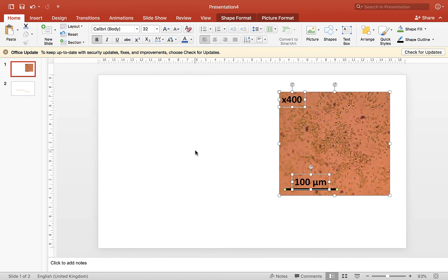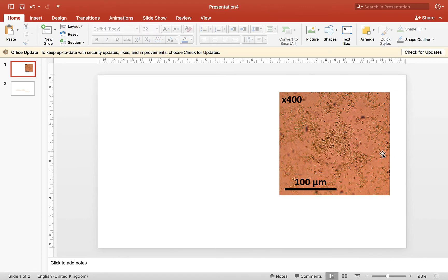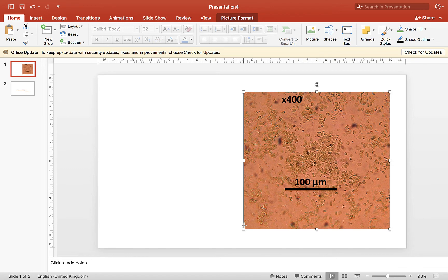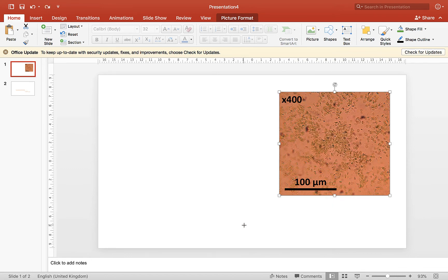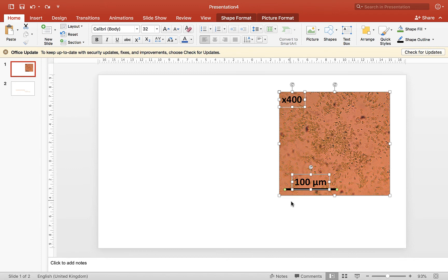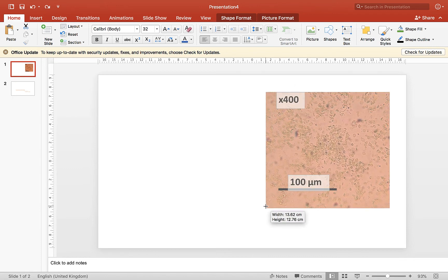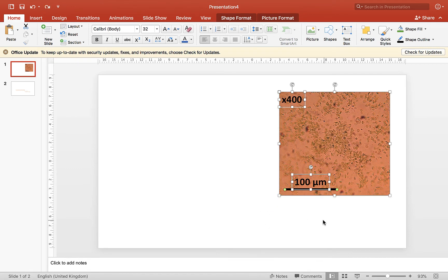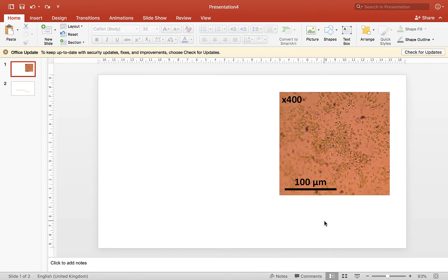So again, if you're moving things around, make sure you've picked up everything. So if I, for example, just move the image now, and I made the image a bit bigger, but I don't do the scale bar, now my scale bar's wrong. So if I want to rescale it, if I want to resize it, select all of it and resize it all together. But try and avoid resizing it too much, because you're more likely to make a mistake.